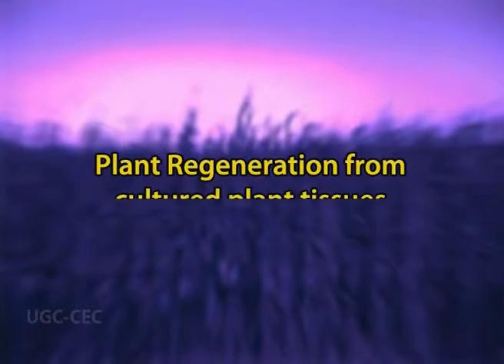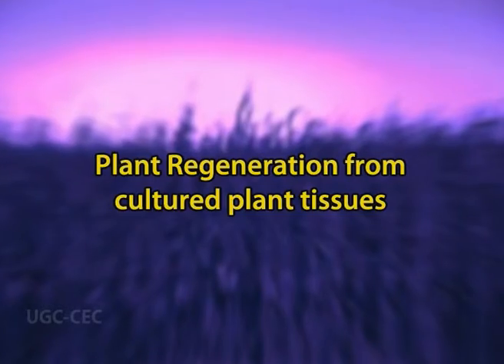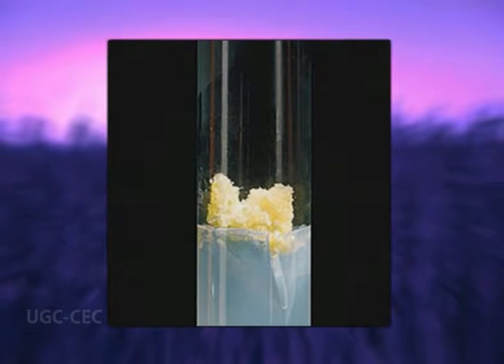The next step of plant tissue culture technique is plant regeneration from cultured plant tissues. When an explant is cultured on an appropriate medium containing both an auxin and a cytokinin, it can give rise to an unorganized, growing and dividing mass of cells known as callus.